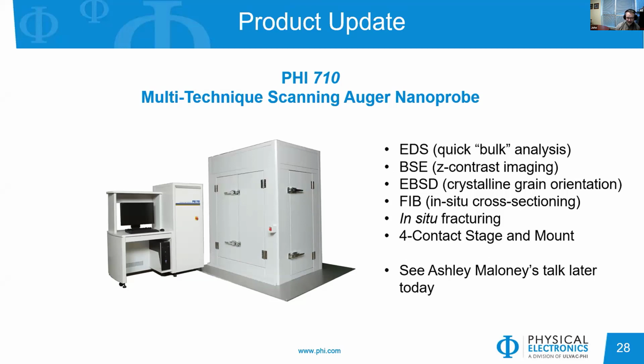We can do EBSD for crystalline grain orientation and strain measurements. We can put a FIB for in situ cross-sectioning. We have an in situ fracturing mount for looking at metallurgical fractures. And we can also put a 4-contact stage and mount in the system. Ashley Maloney will be giving a talk later today that will describe this system in more detail.